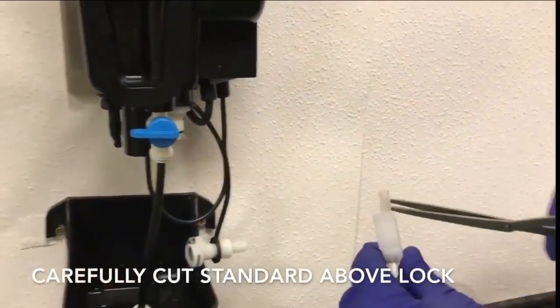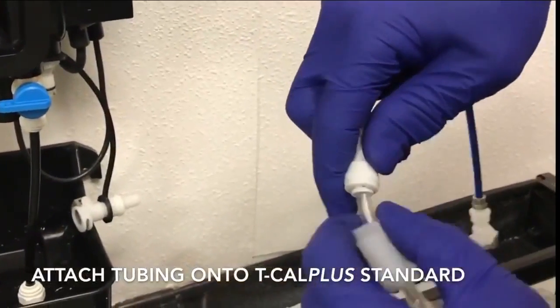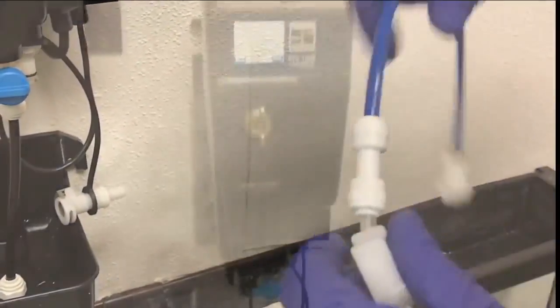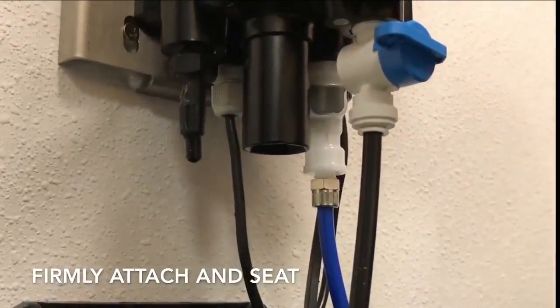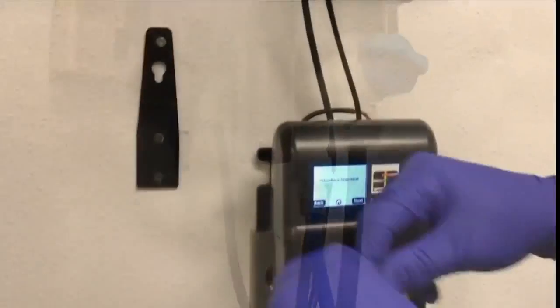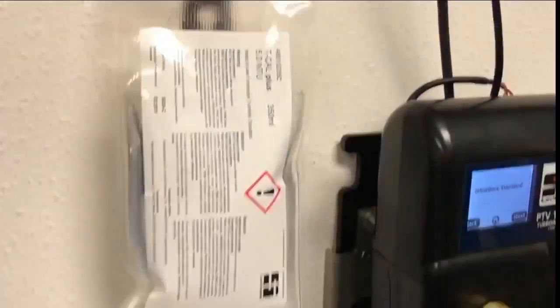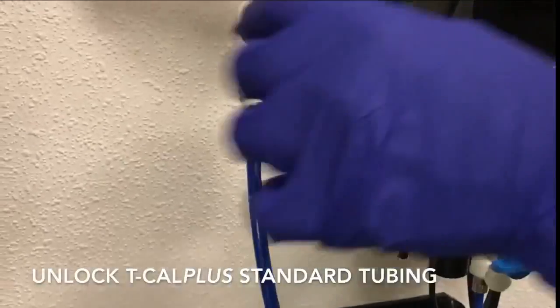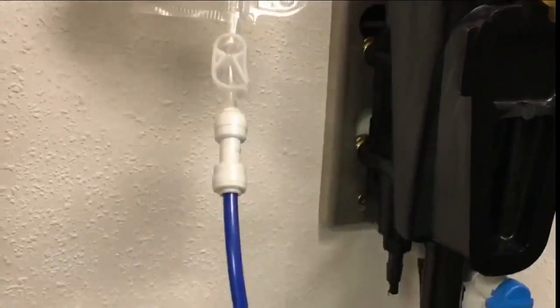Carefully cut the TCAL Plus tubing and attach the supplied fittings. Firmly attach and seat fittings to the instrument. Hang the TCAL Plus standard on a hook above the sensor and body. This allows gravity to do all the work. Unlock the clasp on the TCAL Plus tubing to begin flow to the instrument.